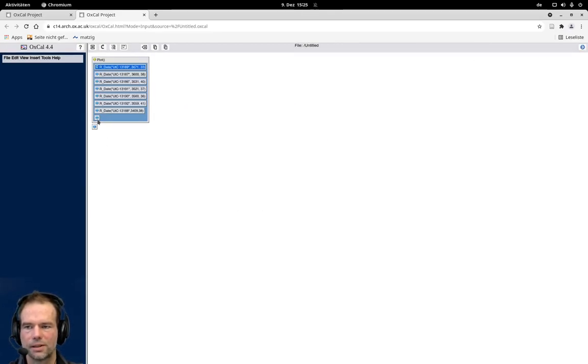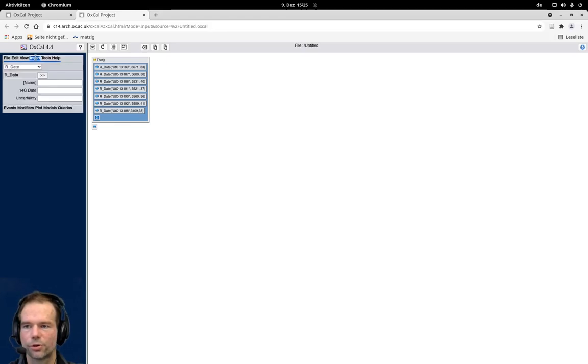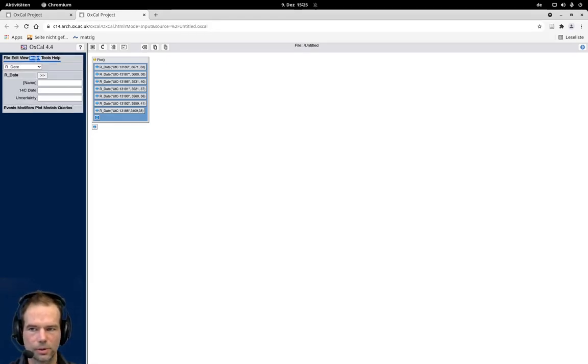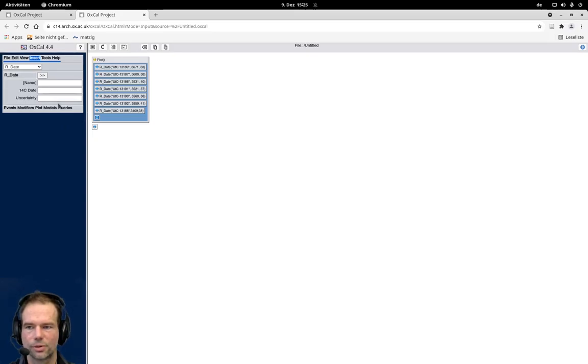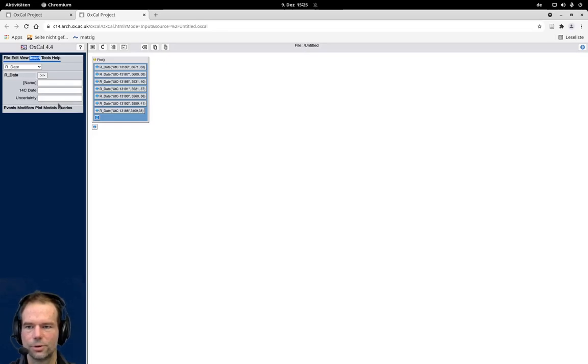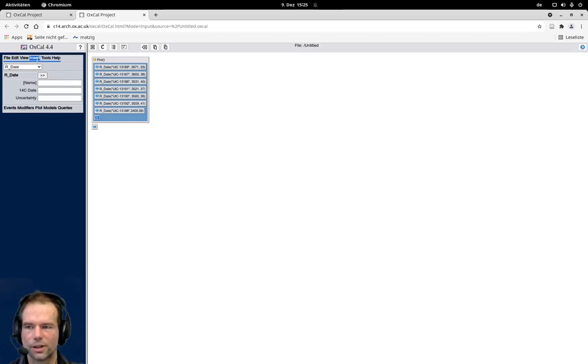If we know that these belong to the same individual, we can insert a new function here. And I will start with using the graphical user interface, but you will soon see that most of the stuff is much easier and much faster if you do that directly in the code. So we click on insert.